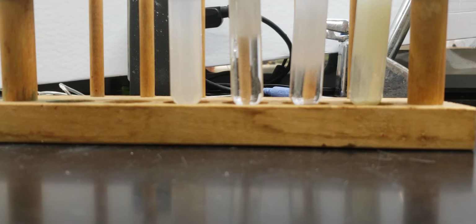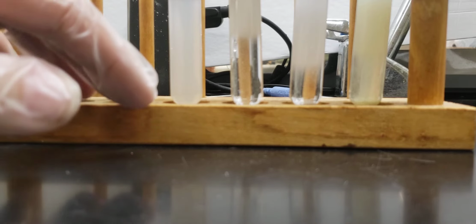And the reason that it does that is that there's no more silver ions competing. So any silver ions that want to go into solution will be able to do so without any competition from the silver ions that are already in solution. So this is going to be something that if it affects the solution, it'll help us to narrow it down. The reason that it's going to help us narrow it down is because two of the solutions will be affected by it because they have a relatively high solubility compared to the third.